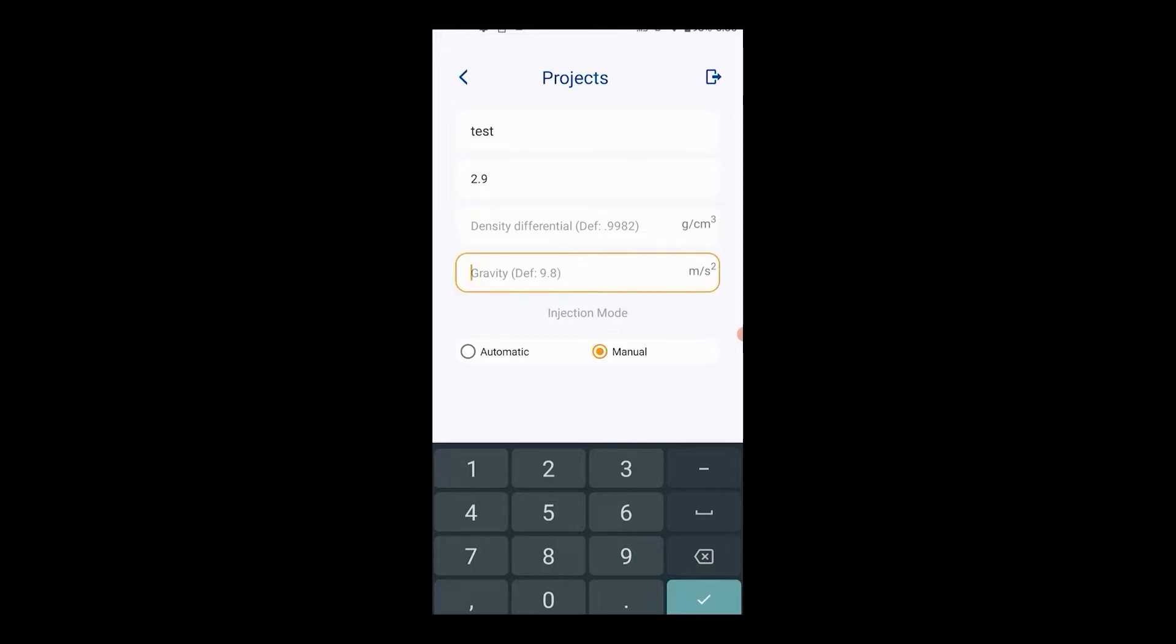And finally, the acceleration of gravity; the default value is 9.8. If you wish to provide a more precise value, you can. Select the injection mode depending on if you ordered the automatic dispenser hardware add-on.